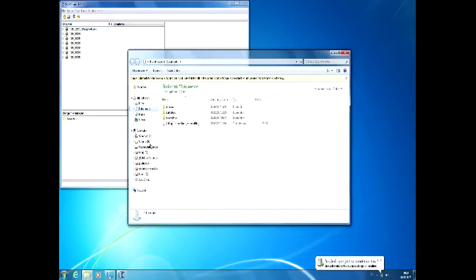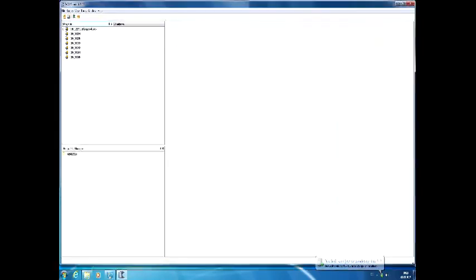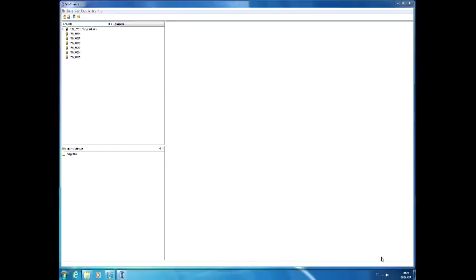Okay, so this is obviously our IVAS tutorial. What we're going to go through is essentially how to do a proper reconstruction and how to allocate your peaks and all that jazz. So everything that you need to start out with a data set from the atom probe and then get to analyzable data. And then we're going to do data analysis. We're going to look into data analysis with IVAS a little bit, just to show you what's there, what you can do with it. Because for quite a few of you, that might just be fully sufficient in terms of what you need.